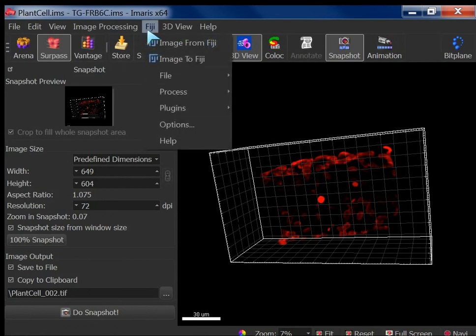What you said basically now, that in your algorithm, right? Your question was, is it possible to remember what you did before the wizard, right? Because when you create a wizard, the creation wizard, that algorithm only remembers whatever you do in the wizard. So it doesn't remember what you did previously and later. But that is possible using a MATLAB script that we have written.